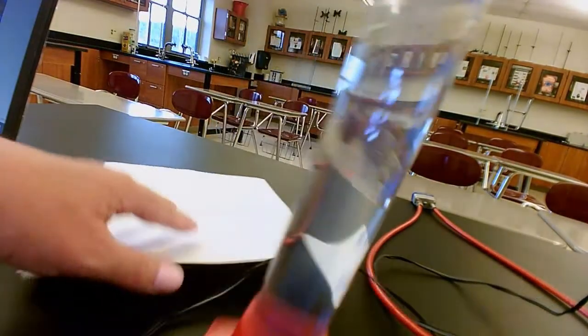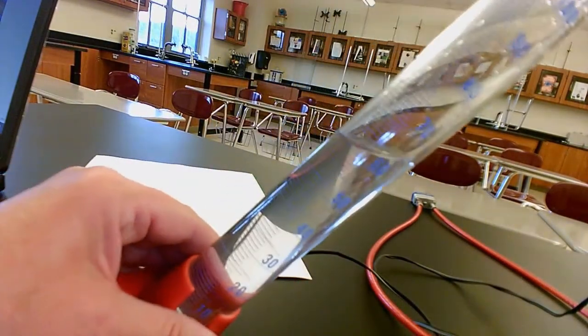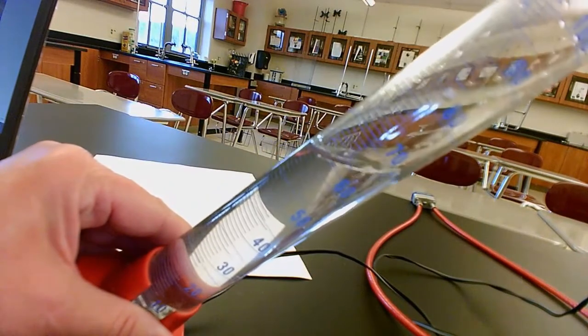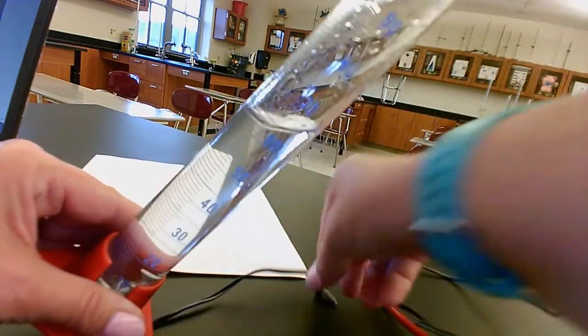So you're recording for part B the volume of water. All right, the next thing it tells us to do is carefully add the screws. Now, I always tilt the graduated cylinder so they don't slam at the bottom.